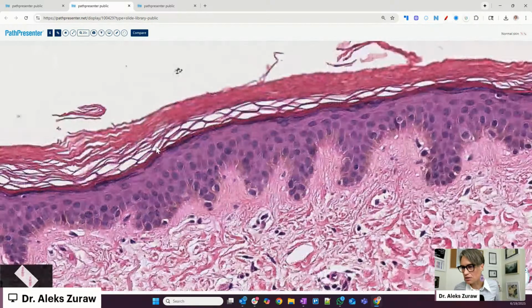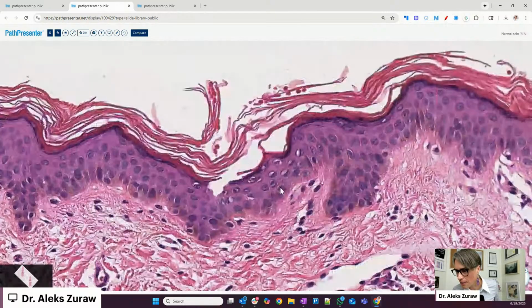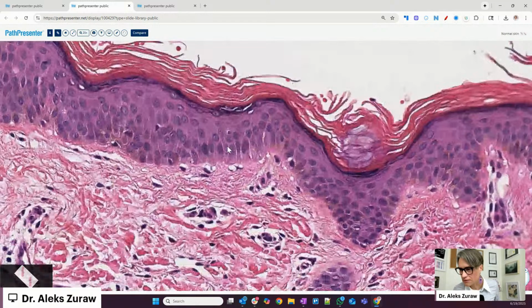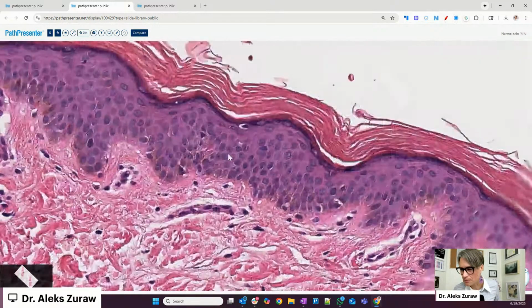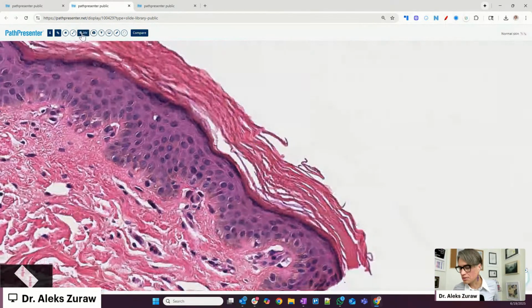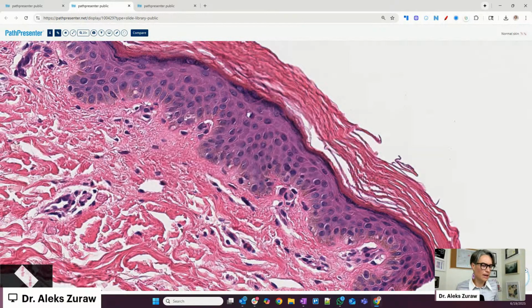If I find any, I'll show them to you for sure. Trying to find some for you. Maybe if we would go to a higher magnification, but for this one we can only do 20x.